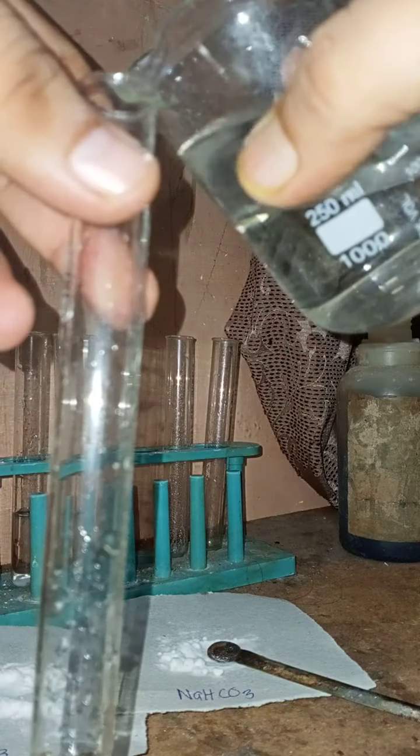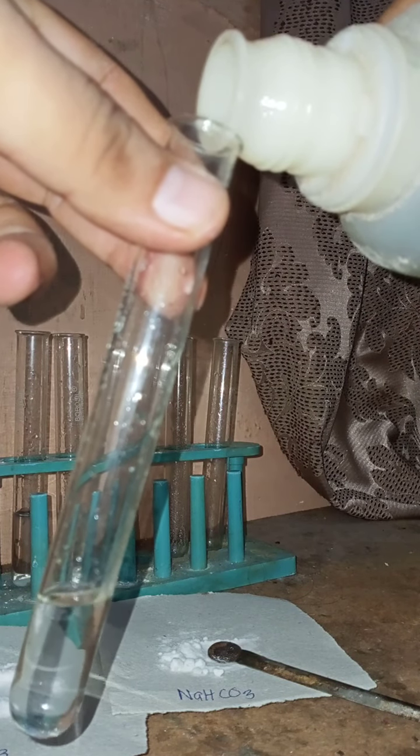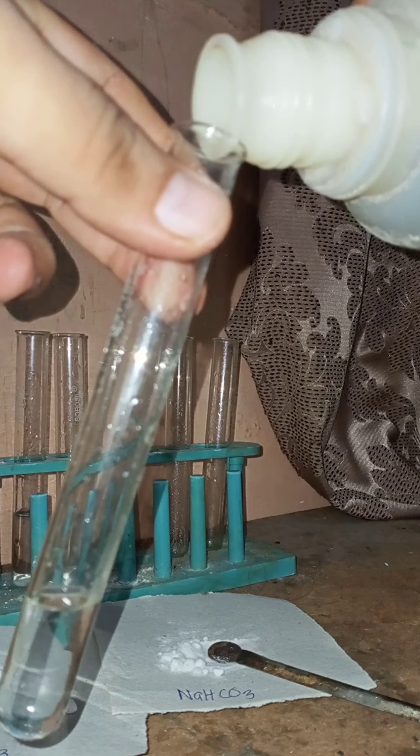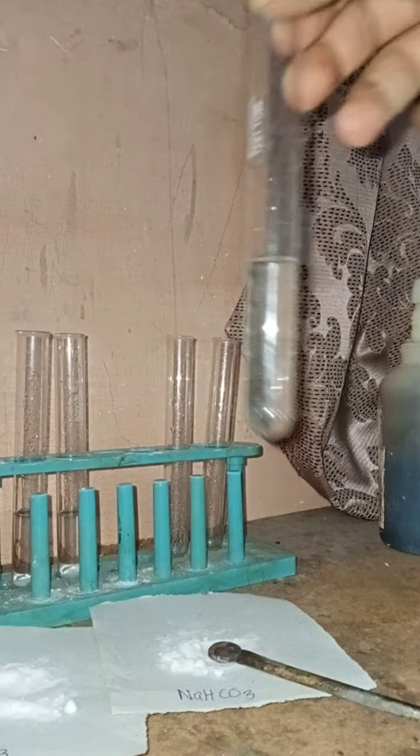And then we are going to make the dilute acid solution. For that we have taken water. In this water we are going to add some acid, so we get the solution of acid. Here we have a dilute solution with us. Please remember that when we dilute a solution we should add acid to the water, but not the water to the acid. Now we have two test tubes.